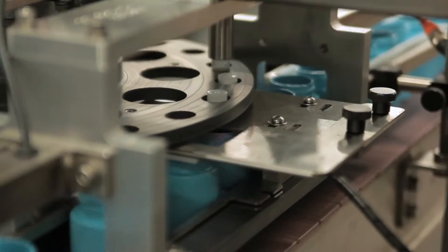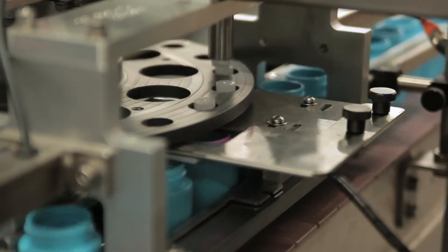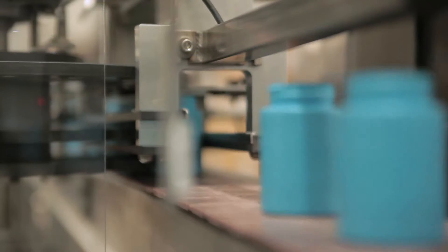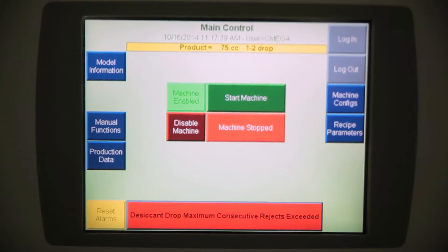An opening is provided in the shelf which allows the canister to drop into the bottle. Verification sensors detect the bottle presence and canister drop. If either condition is not sent simultaneously, then the machine is programmed to stop and display an error message.